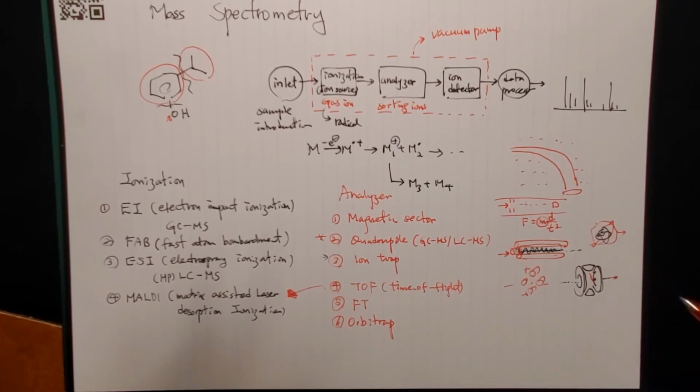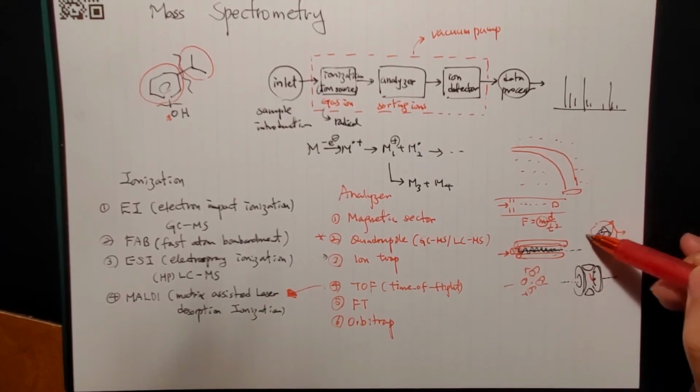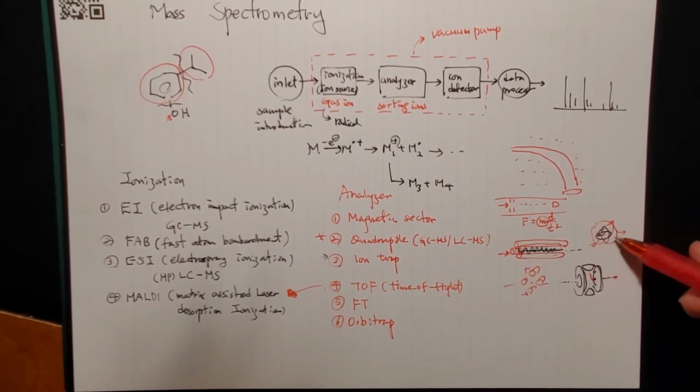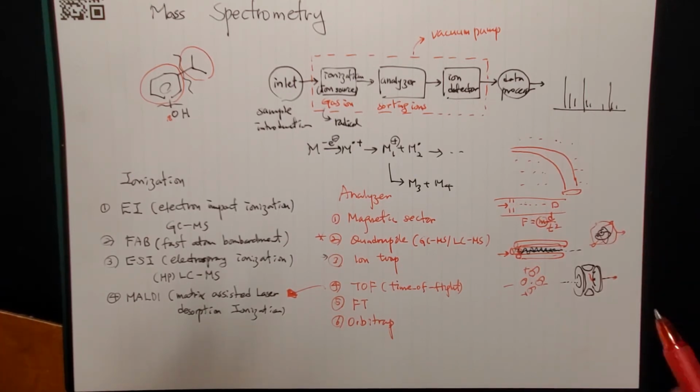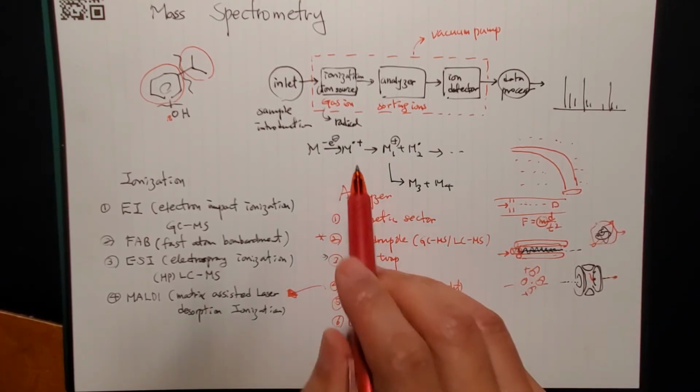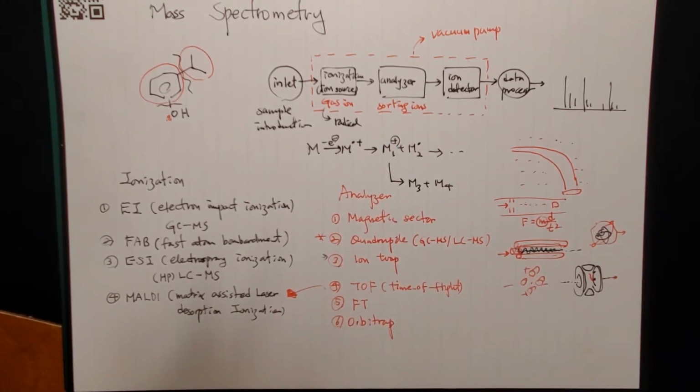Then you increase the influence of the electricity. You make the heavier ones move more and more, and then have them exit. Then you increase more and let the next heavier one out, and so on. So the lighter, fragmented ones go out first, and then the heavy ones later, and so on.